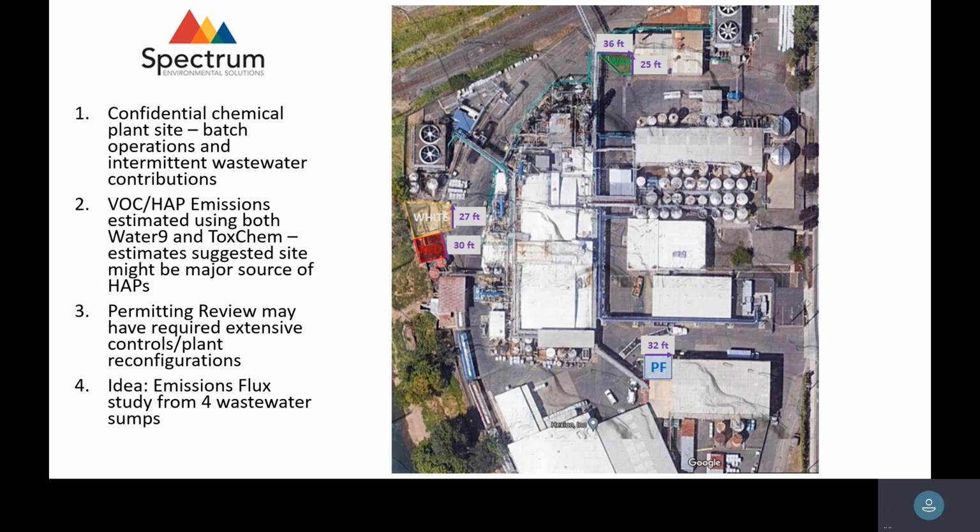Here's our site. So we did this last fall. It's a very complex, very tight, small facility. They had an issue. It's a batch operation, wild and variable wastewater contributions, just what you would imagine at a batch site. A lot of concentrations of wastewater samples that they would go out and grab. They never correlated their grab sampling with what their actual operators are doing at the time. Wickedly wild, crazy numbers. There's a couple of interesting pits, the red pit, the white pit, a pit up here, and another one down in here.